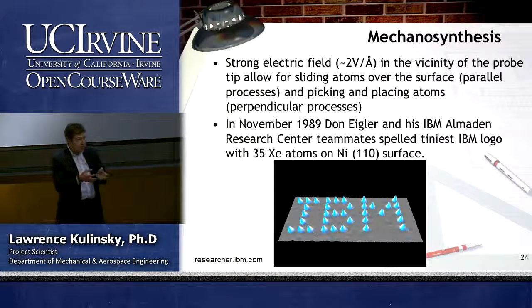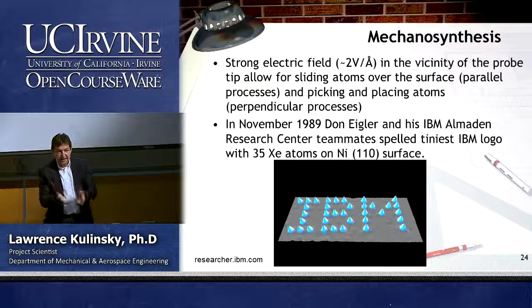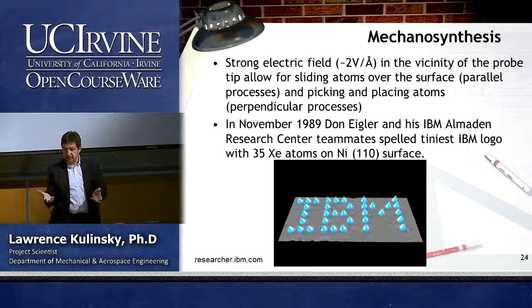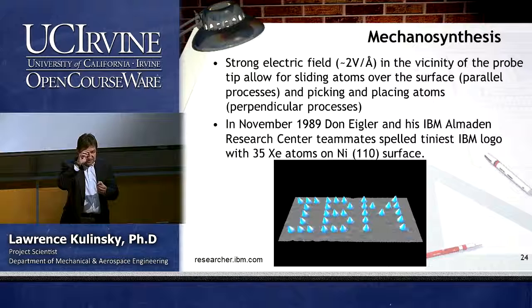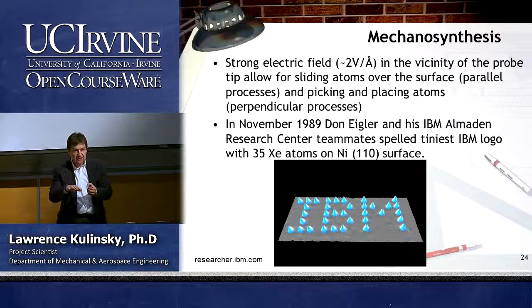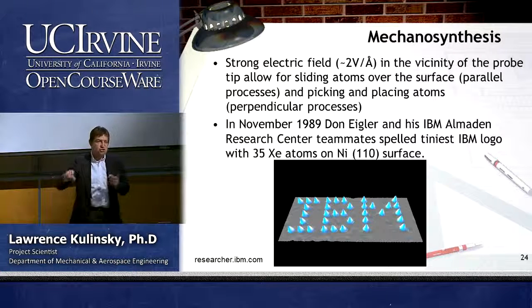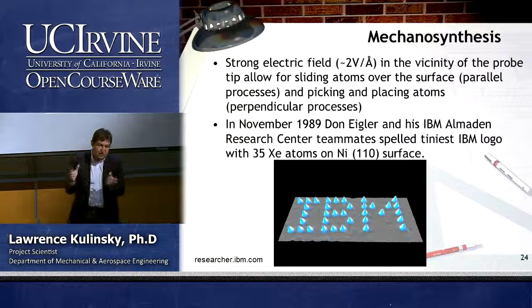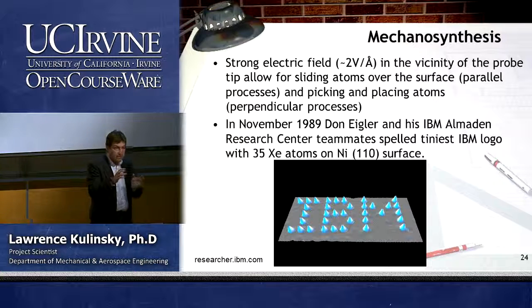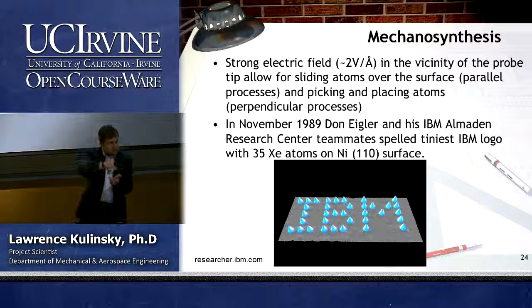So basically it means that adhesion between the tip of the microscope and the atom, this electron cloud overlap, for a second is stronger than between the atom and the surrounding atoms on the surface, okay? So it almost looks like you're taking it a little bit off the surface and you have lateral force and it lands next to its location. And then you do it again and again. So you can use directed diffusion, if you will, because in fact the atom never totally leaves the surface.